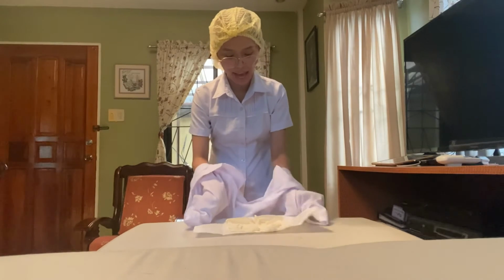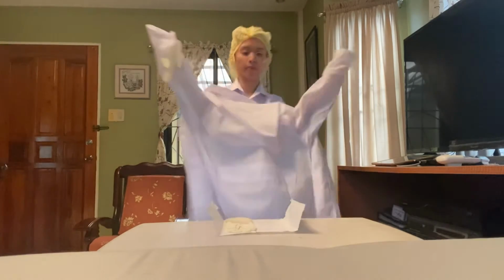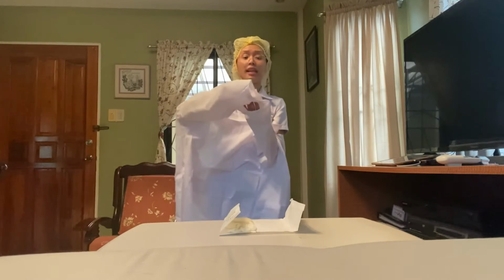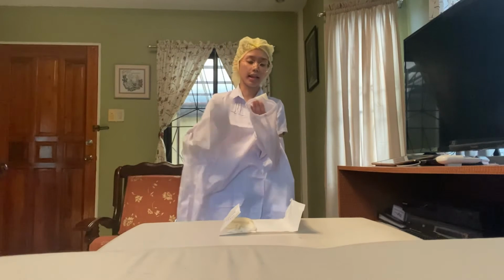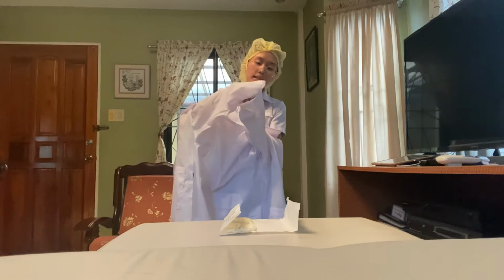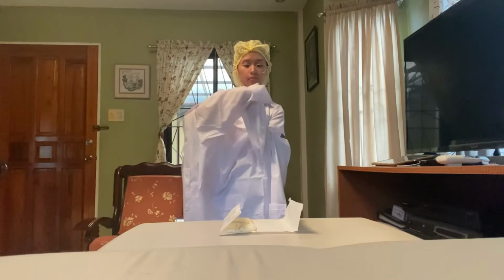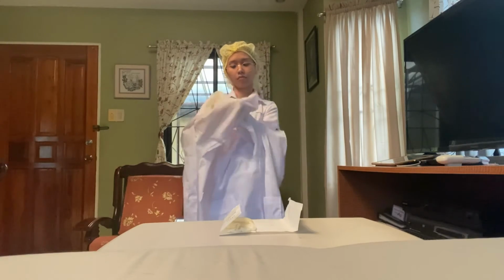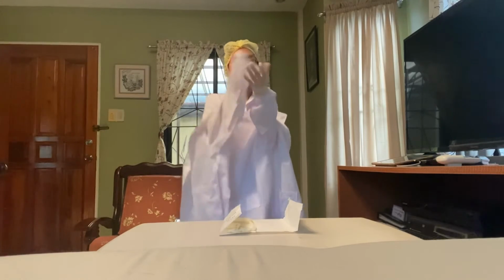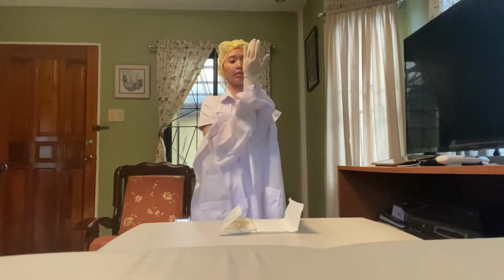So using my right hand, I'm going to pick the left glove up. And I will make sure that the left thumb of the glove touches the left thumb of my hand. And then slide your hand all the way in of the gown. Just like this. So make sure that your hands or your fingers are inside the holes. And you can adjust the gown after.